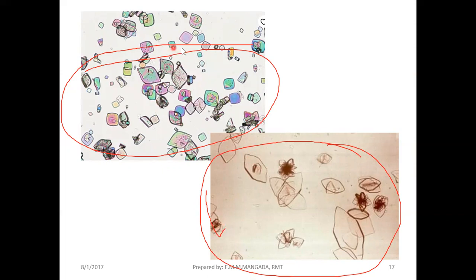But with your polarizing microscope, you can appreciate the crystalline characteristic of our uric acid crystals. So we have there various blends of colors. Okay, as you can see, we can appreciate it. And the colors of course depend on the rotation of light in those areas of the crystals. Okay?